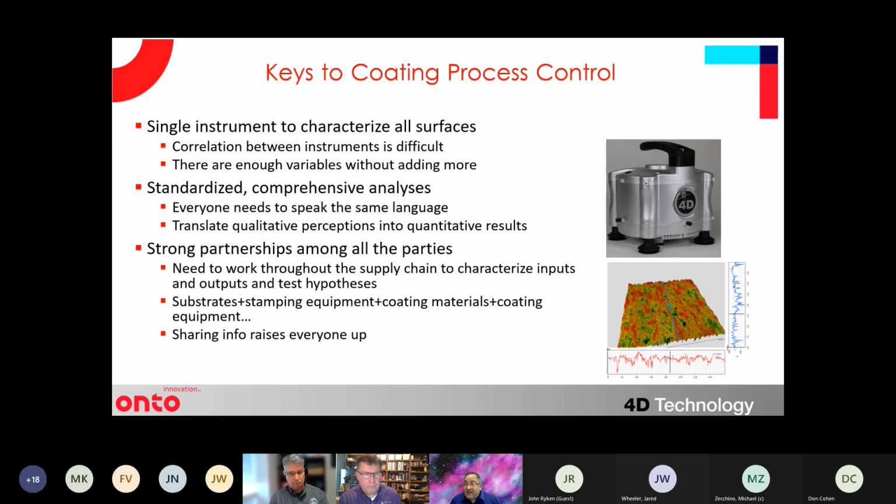But because this is light based, it's essentially a very portable, vibration resistant microscope with a large field of view. So we need the light to bounce back. So we won't do layer thickness of opaque layers with an instrument like this.